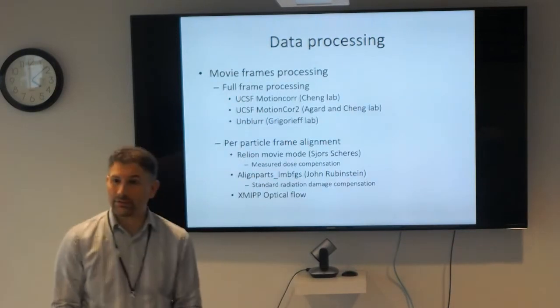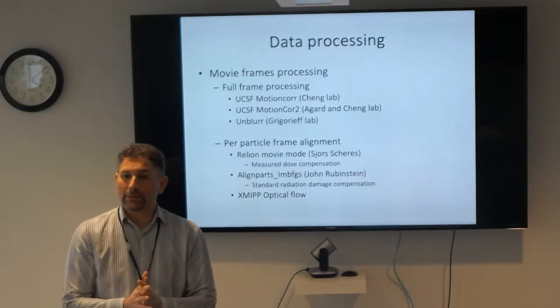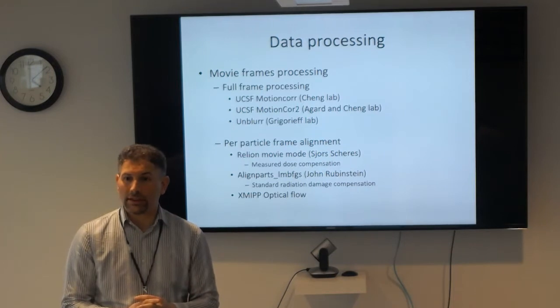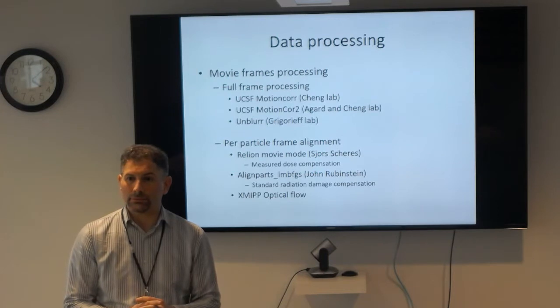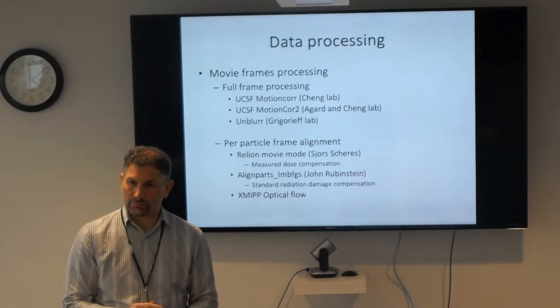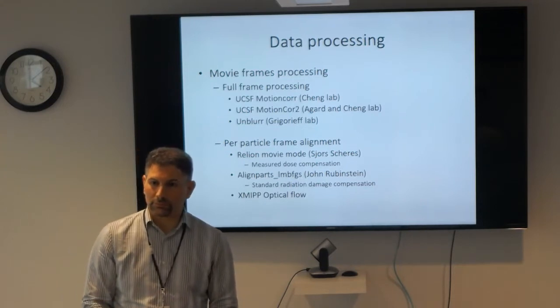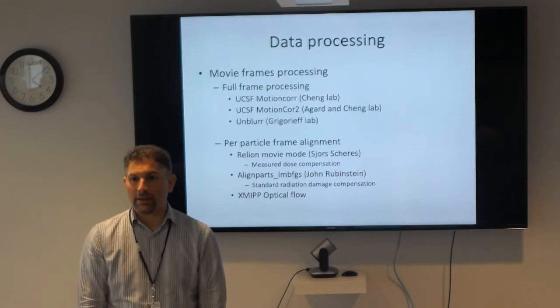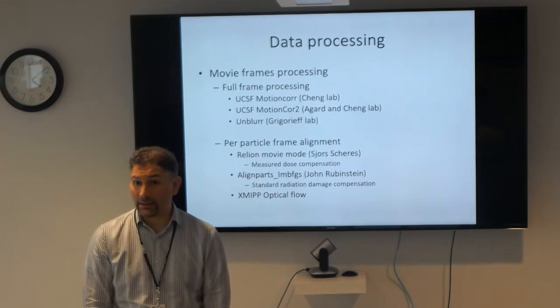Yes. So you said there will be some particles that have very few views. If you just do 2D classification for them, that will be the class that looks very awkward, where there's so much noise, and Relion seems to suggest throwing those classes away. So now you're saying you will try to rescue those classes. Is that the point? Yeah. So you're talking about the spiky.